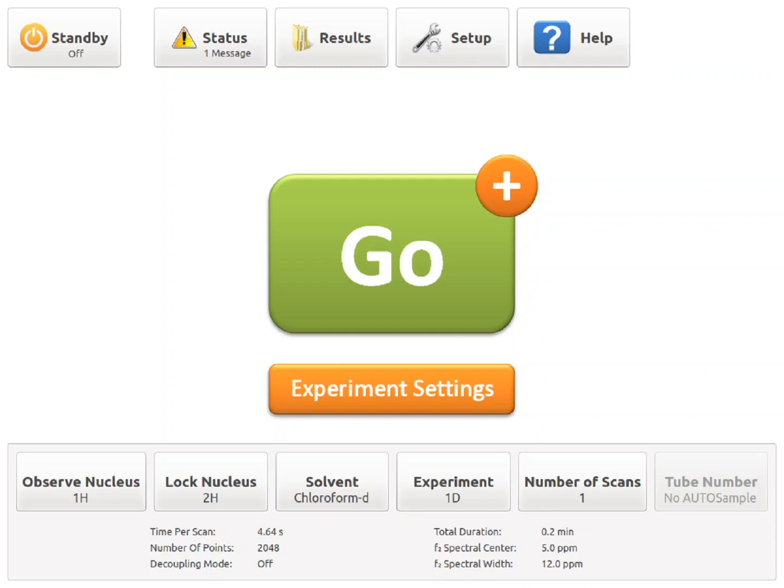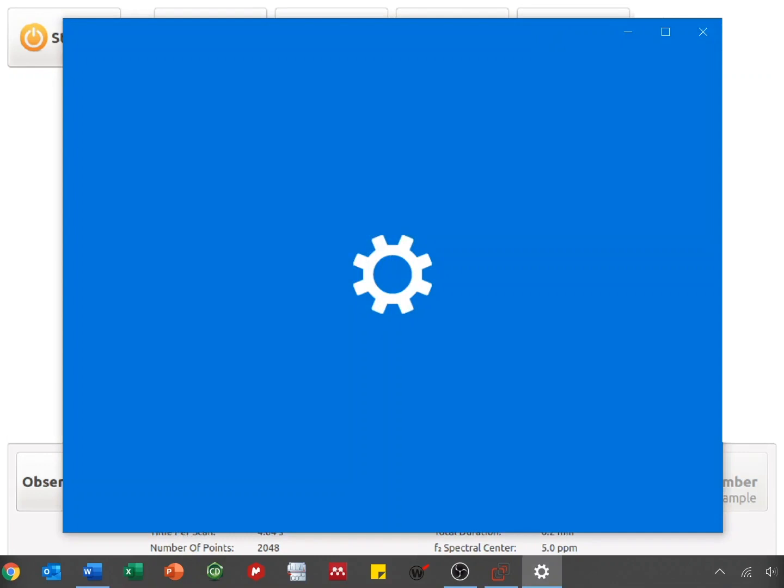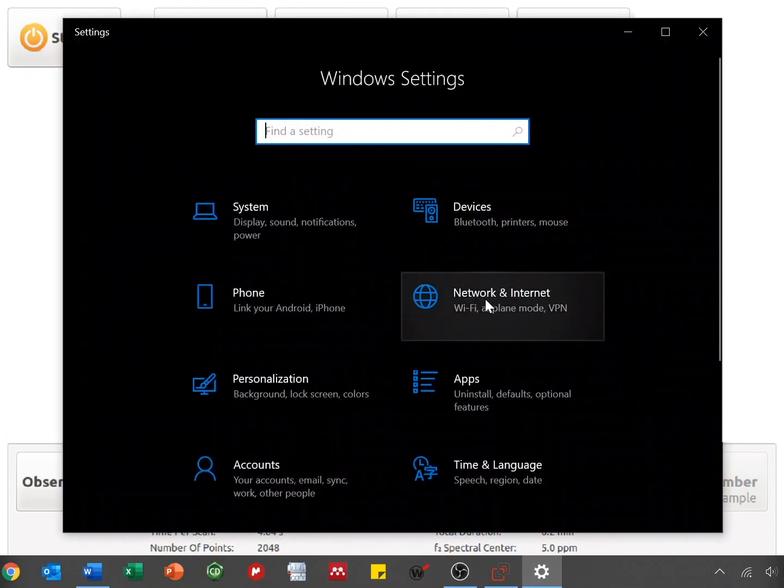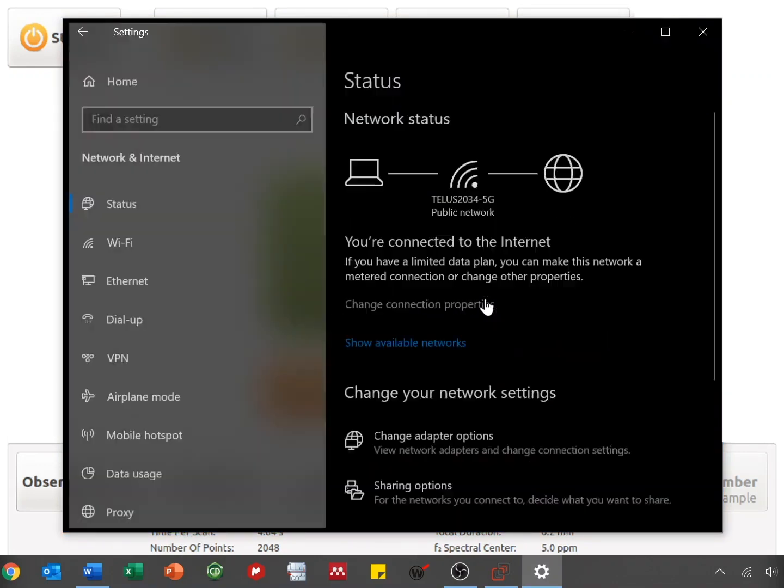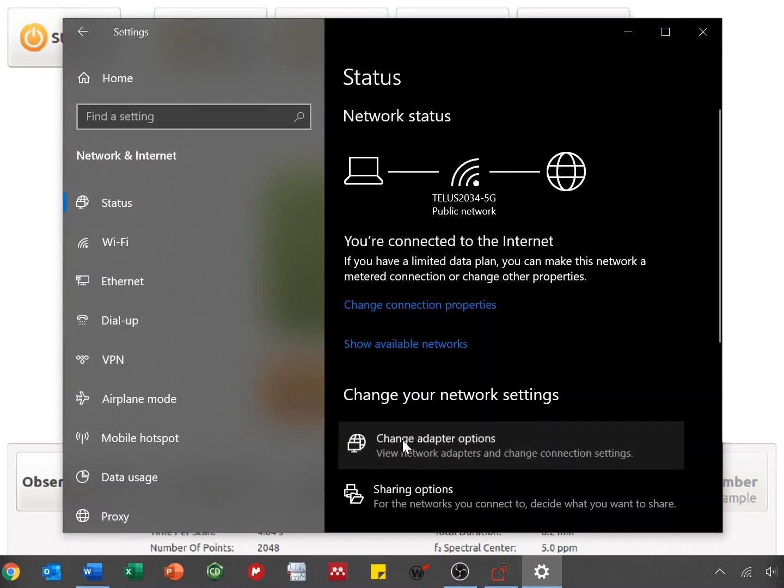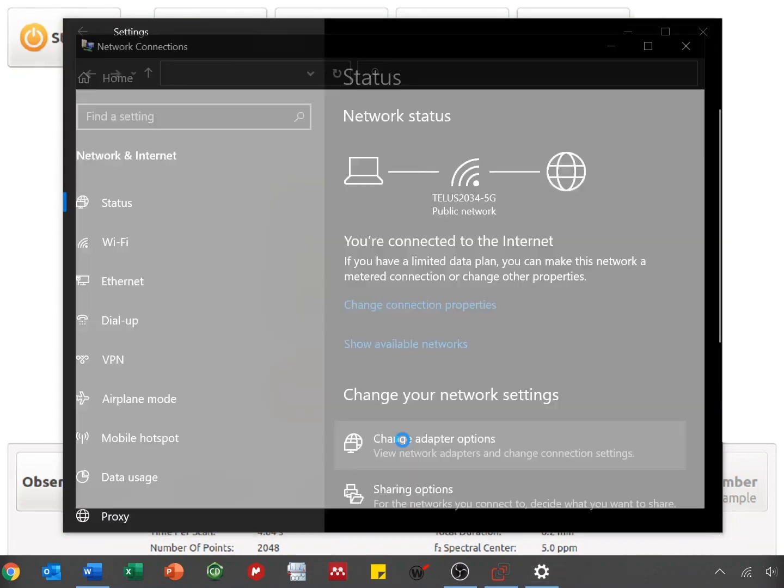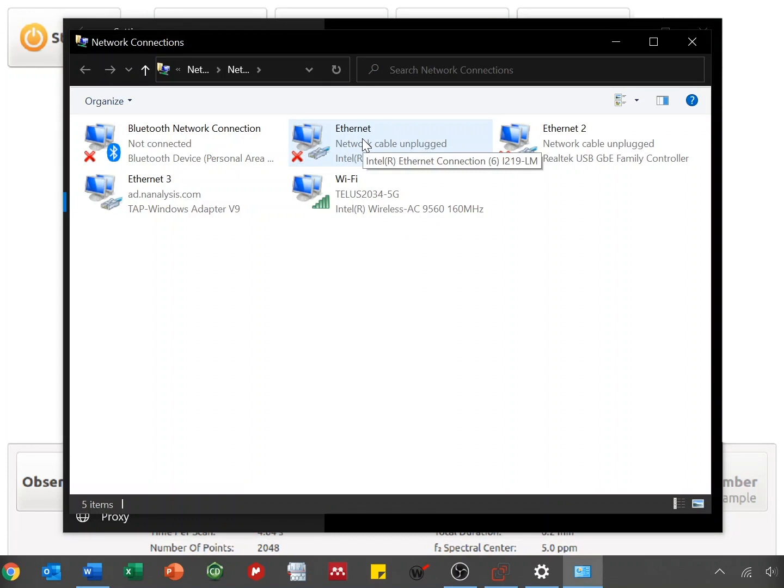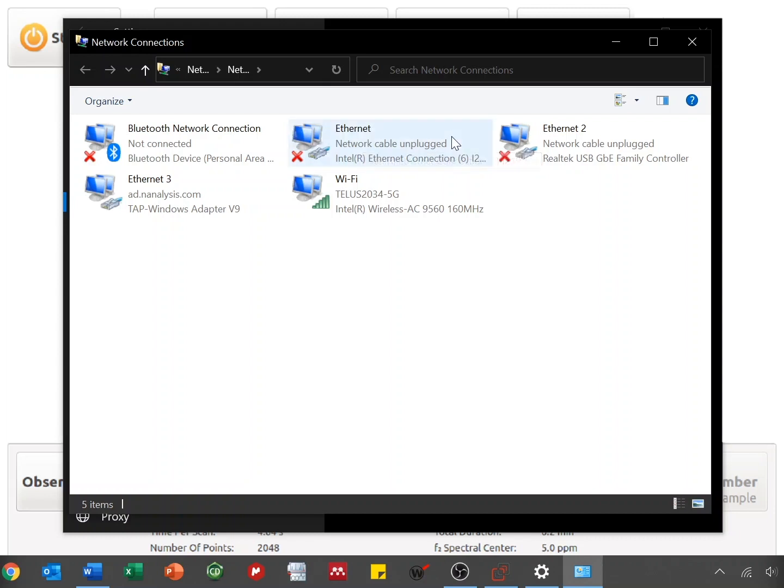On your PC, navigate to Settings, Network and Internet, and then Change Adapter Options. Right-click on the local area connection associated with the Ethernet cable that was plugged in and select Properties. Note that I'm not currently connected directly to the spectrometer, so this doesn't show that it's connected, but it will be this Ethernet cable connection here.